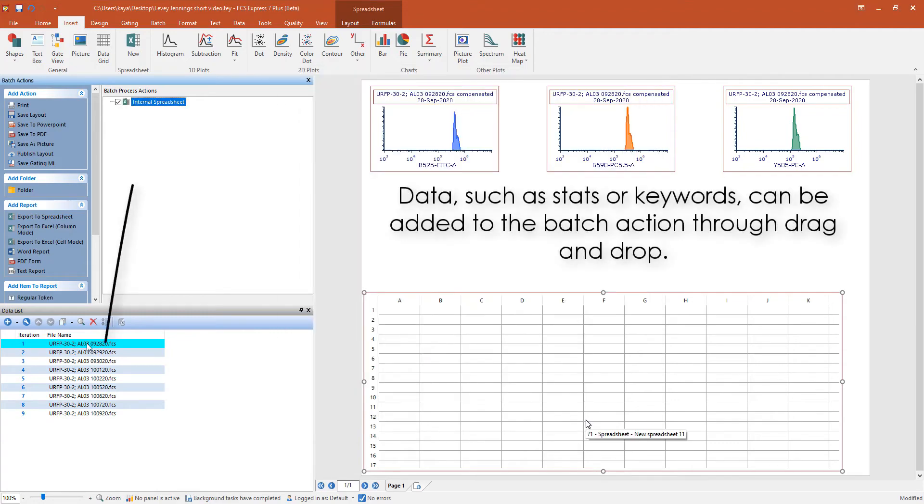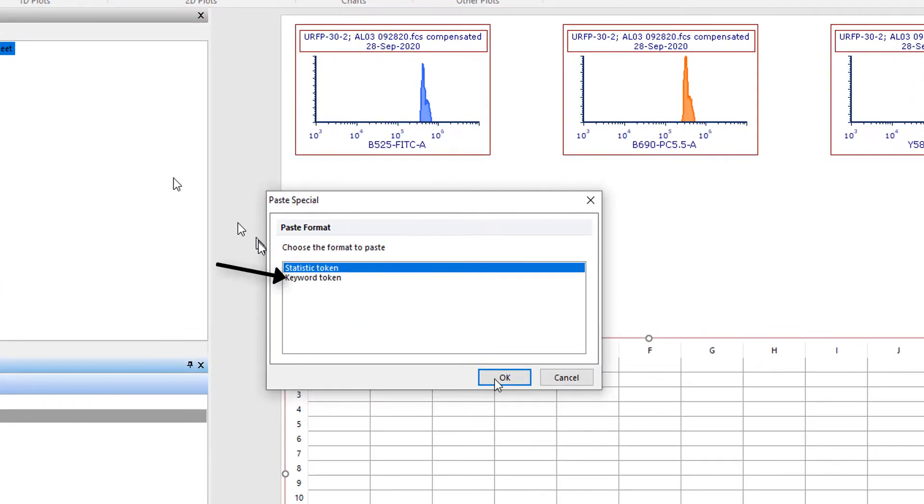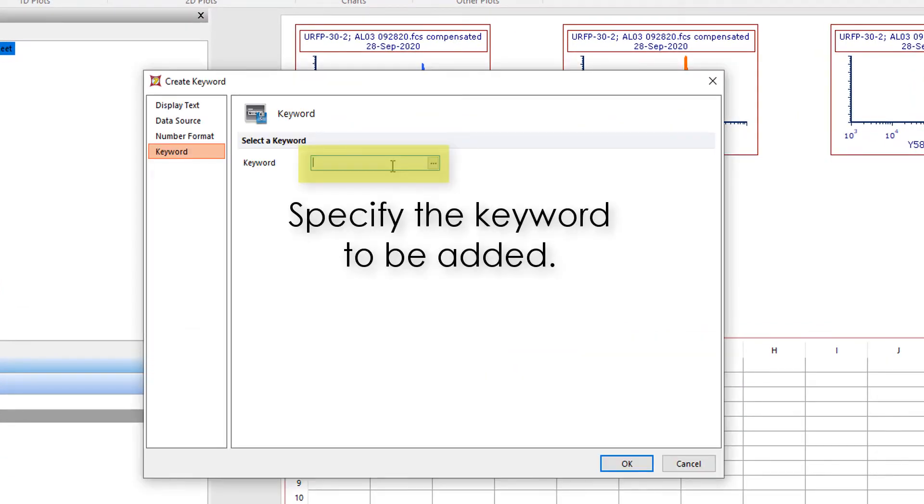To insert the date, drag and drop the first file to the Batch Process action and select Keyword Token. Type $date and click OK.